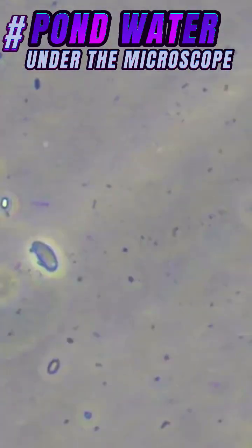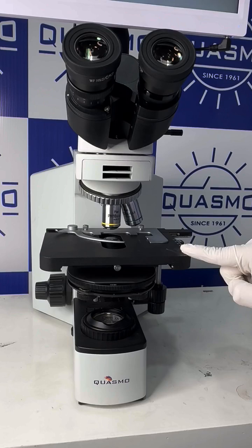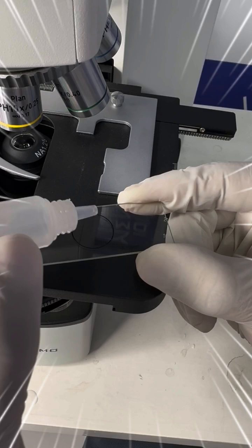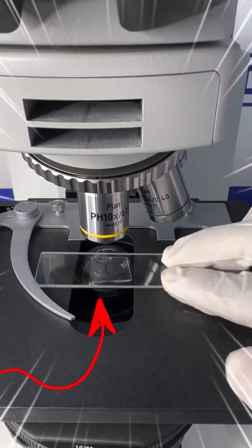Hello guys, today I'll show you how pond water looks under the microscope. This is the microscope — this is the phase contrast microscope which is manufactured by Cosmo. Now we will put a drop on the slide and place the cover slip in the microscope.